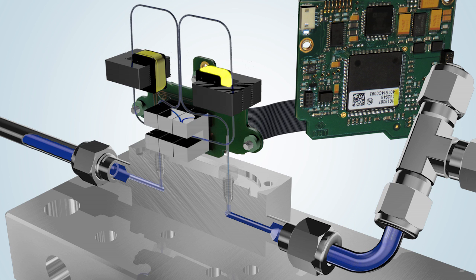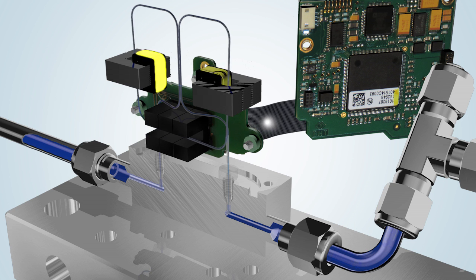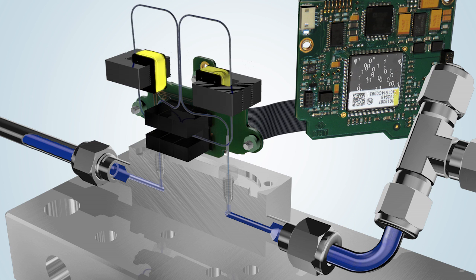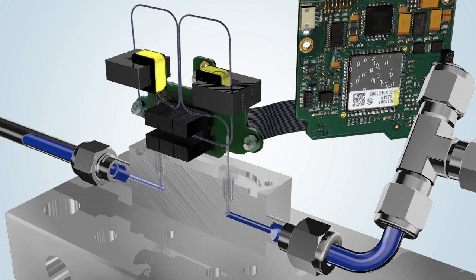A signal is then transmitted to the digital electronics, which translate the measured vibrational value into a mass flow value, and compare this to the set point from a PC, PLC, or analog port.